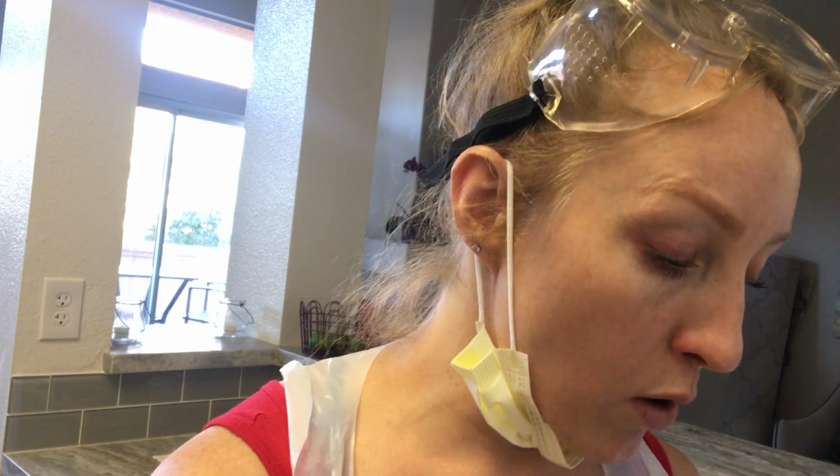So a gram-positive has a thicker wall. It has that peptidoglycan wall, and the gram-negative has it as well, but in the gram-positive, it's fairly thick. And so what happens, the first thing we do, which by the way, I just took a swab of my cheek that I'm going to show you here.